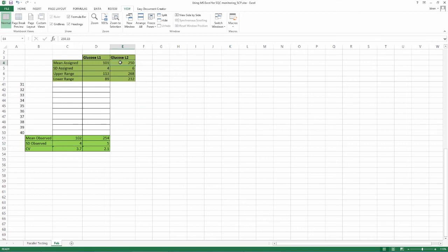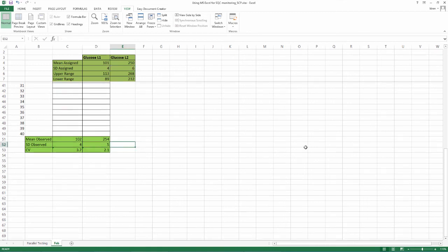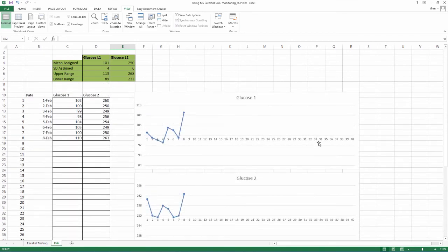In L2, assigned mean is 250 and observed mean is 254. Assigned SD is 6 and observed SD is 5. At this point, there is no significant error present. But, by observing the graph and the developing values, any developing error will become evident. So, how about the CV percentage?